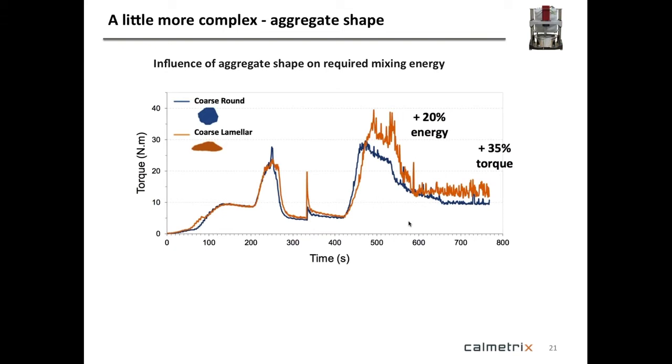So this is not about unrealistically going back to your supplier and asking for something it cannot deliver to you. It's about understanding the issue with the rheometer and being able to compensate for it. As we all know, the first part of solving a problem is understanding where it comes from. So when you measure it, you're able to tell. So this shows you an overview on this example.